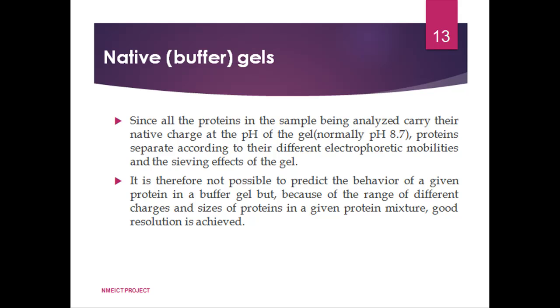An alternative method for enzyme detection is to include the substrate in an agarose gel that is poured over the polyacrylamide gel and allowed to set. Diffusion and interaction of enzyme and substrate between the two gels results in color formation at the site of the enzyme. Often, duplicate samples will be run on the gel and the gel is cut in half, and one half is stained for activity, the other for total protein. In this way, the total protein content of the sample can be analyzed and the particular band corresponding to the enzyme identified by reference to the activity-stained gel.